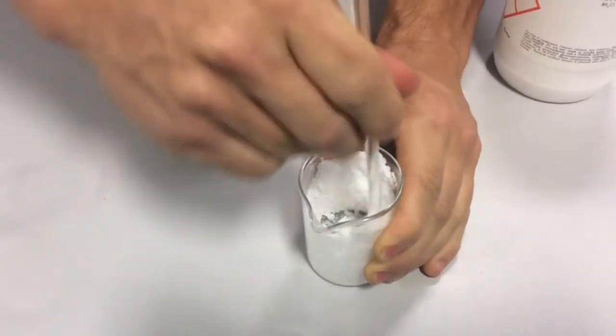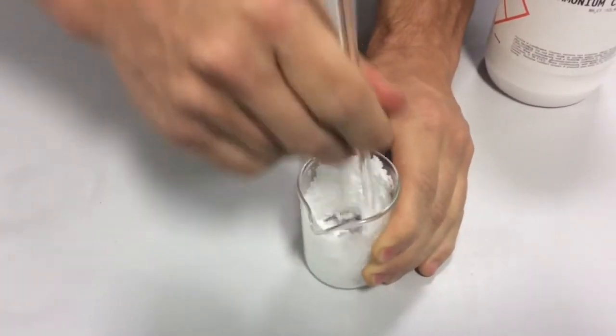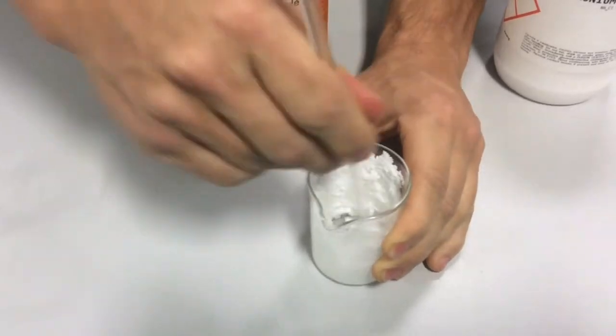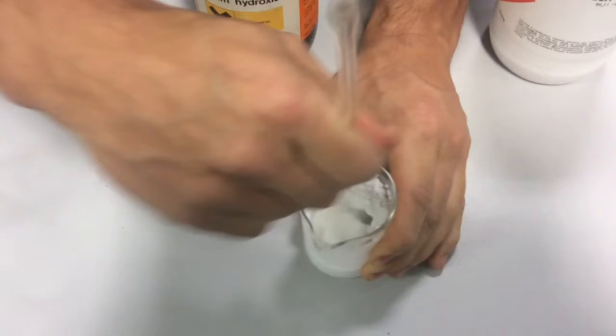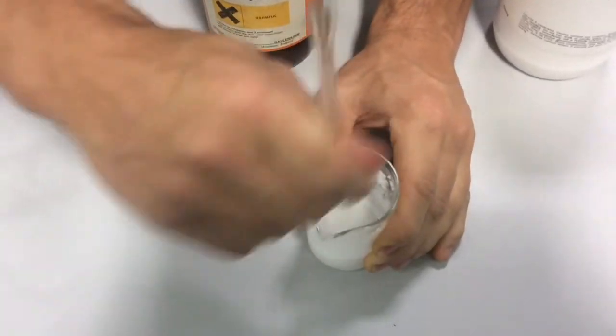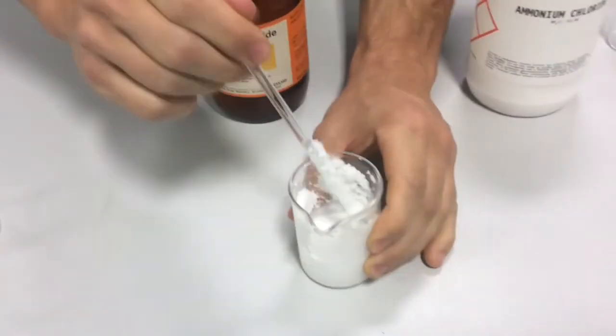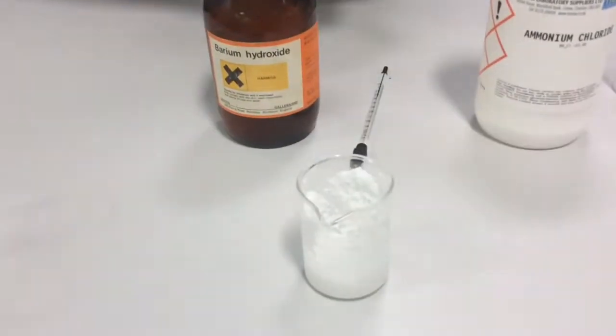Now I keep stirring, it's starting to turn into a paste. Keep going, keep going, it should eventually turn into like a liquid. Look, if I keep going faster and faster. Now what do you think? If that's an exothermic reaction that we looked at before, there we go, it's turned into a paste. If that was an exothermic reaction before, what do you think this type of reaction is?